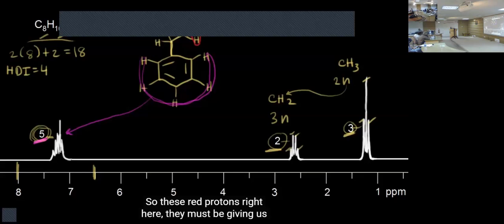But the problem is, your question is right, but you can see all these only when there is a substituent there. For example, right now, you are thinking this is the substituent.